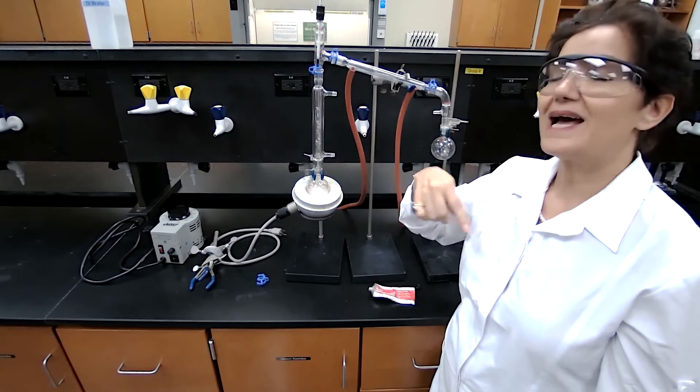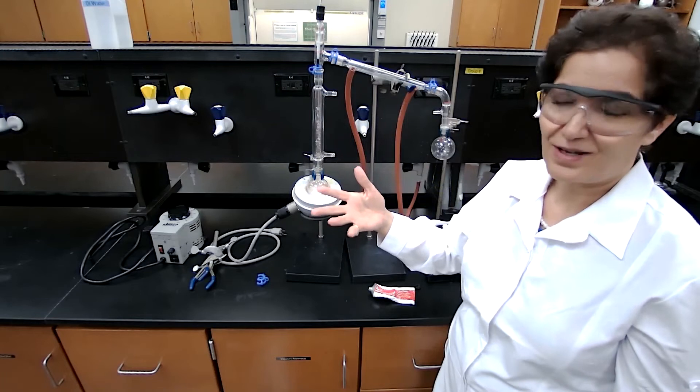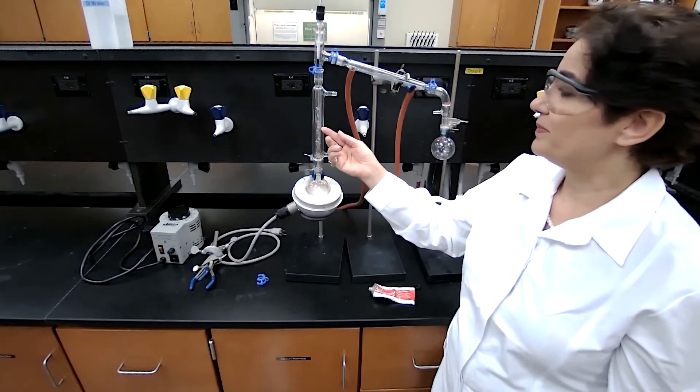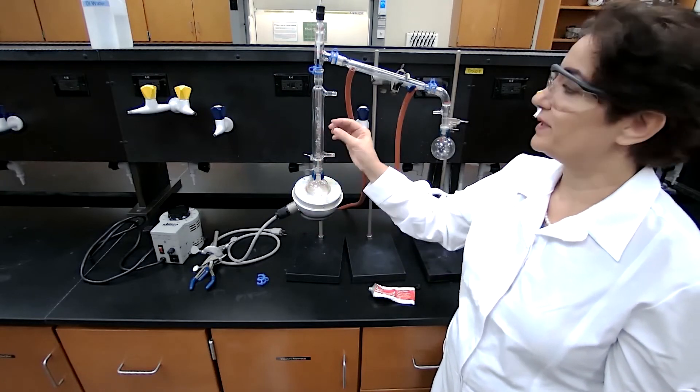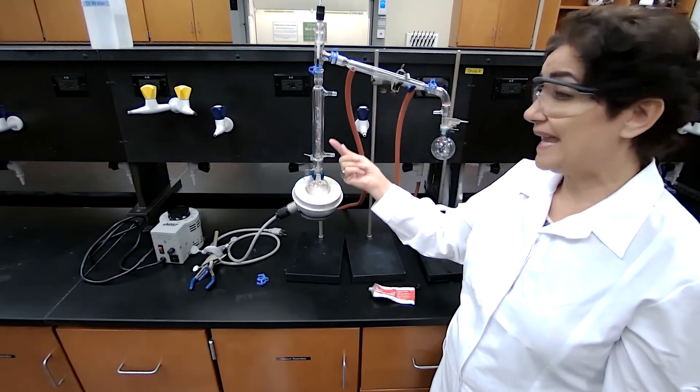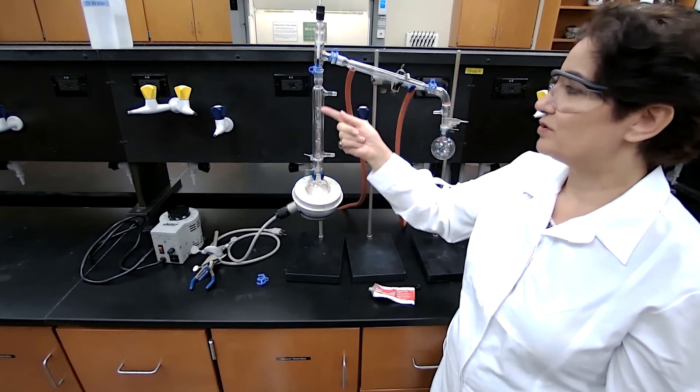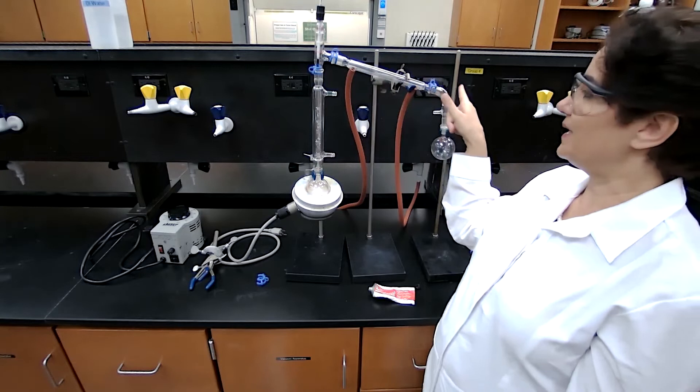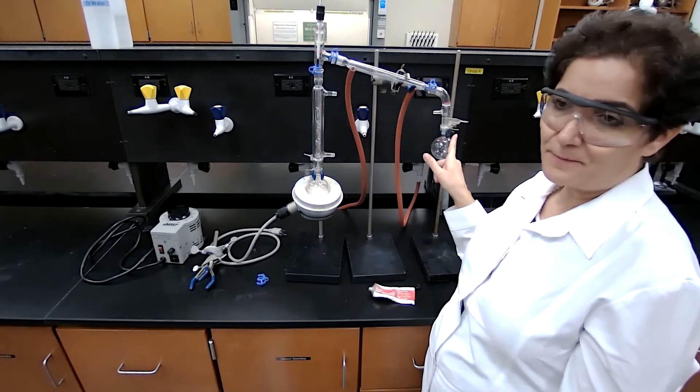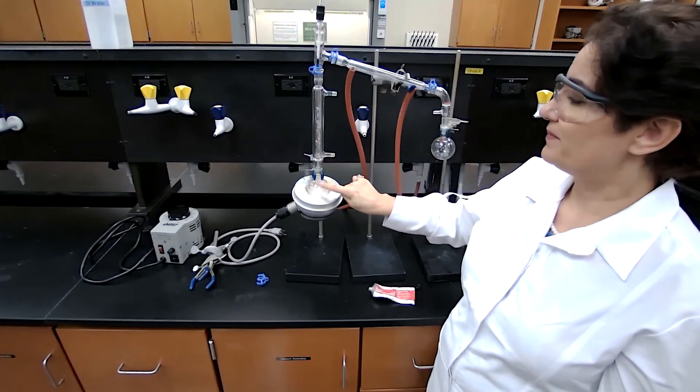Because it has higher boiling point, it would condense faster. So when compound B comes up, the higher boiling point is going to condense and it will go back. Compound A, because it has lower boiling point, will come up, survive, and will go to the distillation head and be condensed.